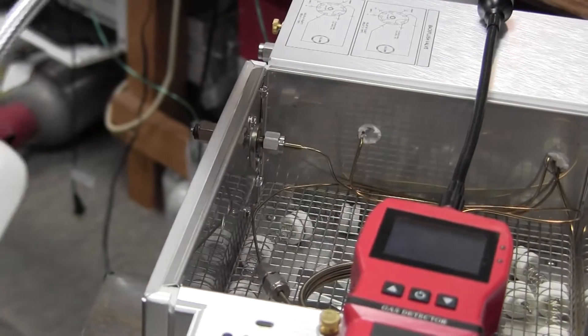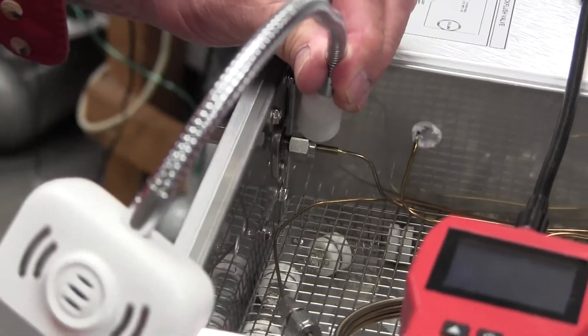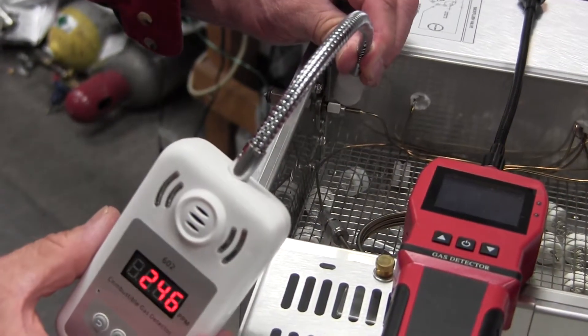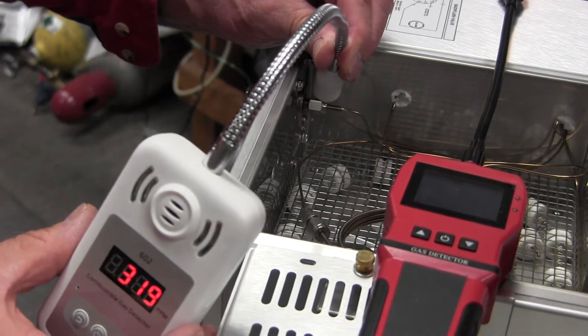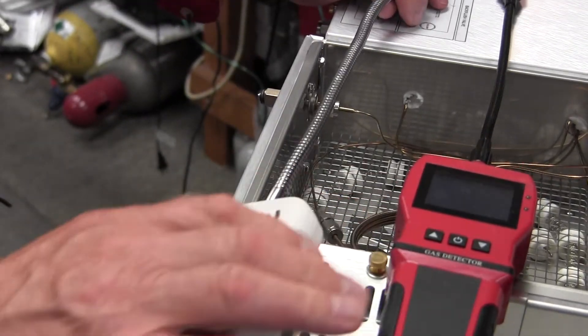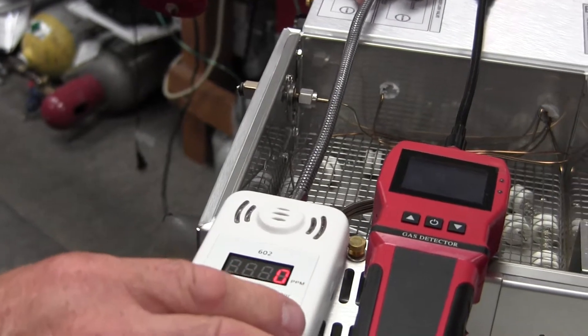That's the more expensive one, and then here's the less expensive one. You can see it still works, but for very small leaks, the more expensive one is more sensitive, so it's easier to find small leaks.